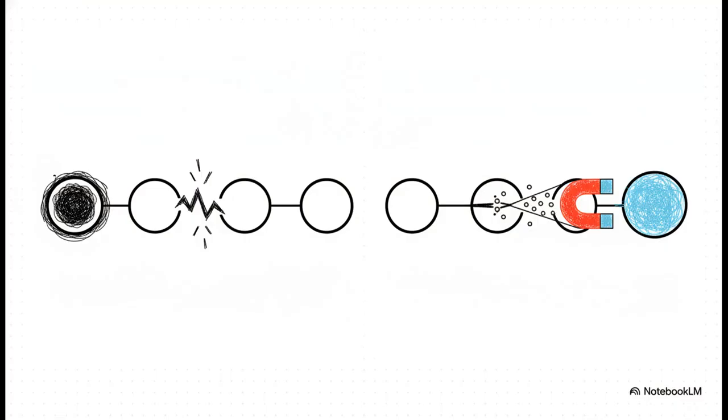There are two dominant ways a single bond can snap. The first is radical site-initiated, or alpha cleavage. Now this one can be slightly confusing. The bond that breaks isn't the one directly attached to the radical site. Actually, scratch that. It's the bond to the next neighboring atom that snaps. The other mechanism is charge site-initiated, which is also known as inductive cleavage. This happens when a highly electronegative heteroatom plays a game of tug-of-war, literally pulling an electron pair toward itself and causing the bond to snap.